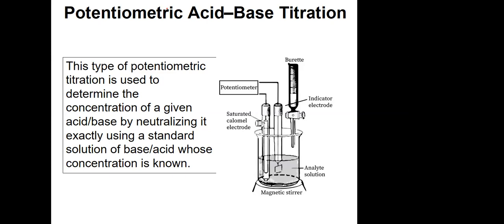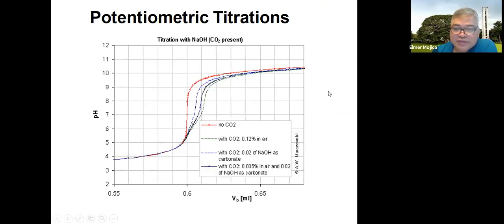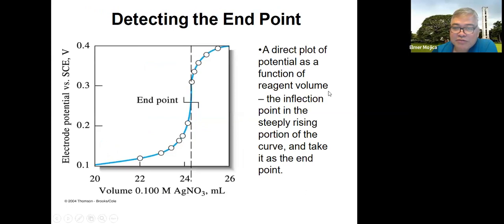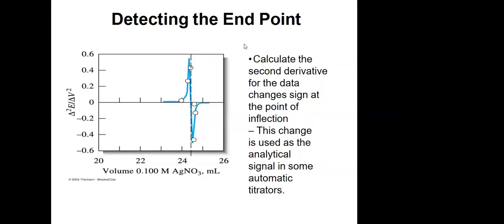How do you ask them to plot the results? Is it just the raw data? Or do you ask them to do what we call, aside from this raw data, the derivative? Meron po until first derivative. Merong plot for raw data and then plot din po for first derivative. Tapos i-compare po yung results.